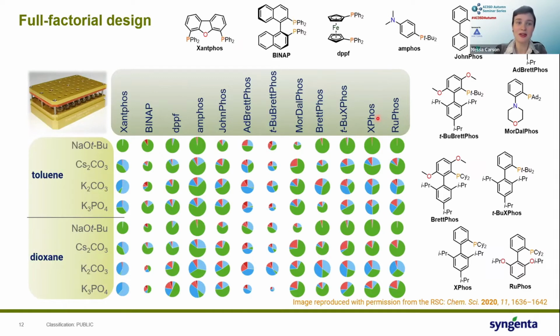I can also use those kind of diagrams to pick up if something's gone wrong, which it might have done. If there's a very low total area across the LCMS, then perhaps it hasn't injected properly, or maybe something's got stuck, or maybe the LC is broken down or something like that. And honestly, in a big table of data, that's actually a little bit harder to see.